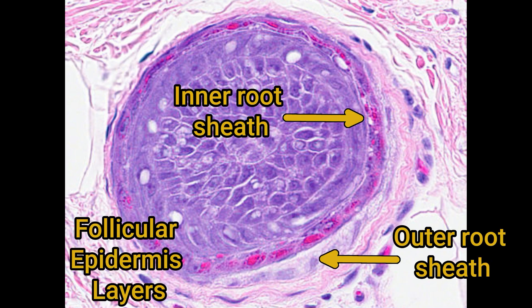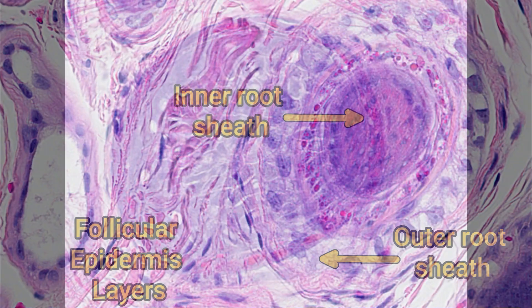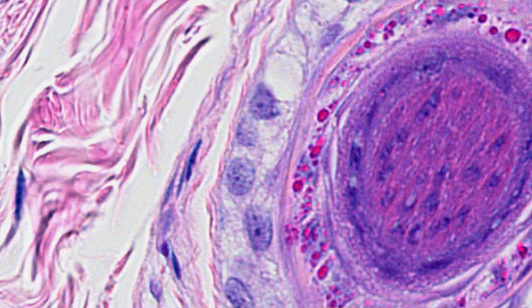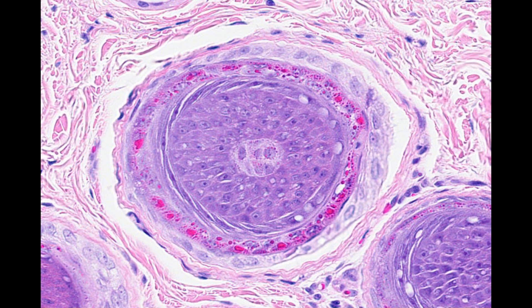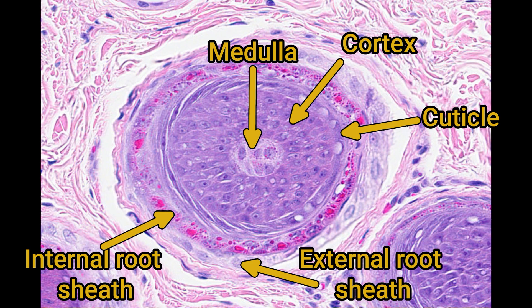The inner root sheath is distinguished by cells that contain bright eosinophilic cytoplasmic granules — trichohyalin granules. The outer root sheath is the layer of cells that contacts the adjacent dermis. Just as with the epidermis, there is a basement membrane between the outer root sheath and the dermis. At this level the layers can be difficult to distinguish, but moving a little further up you'll be more convinced. There is no separation yet between the inner root sheath and the hair shaft.